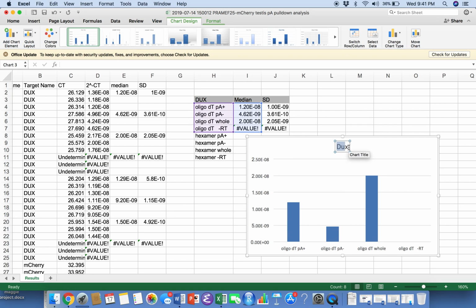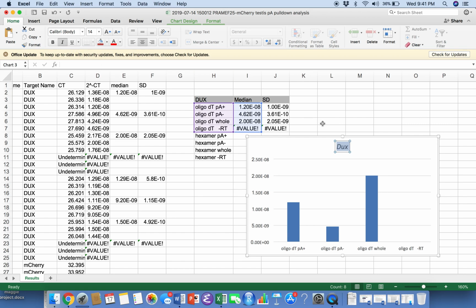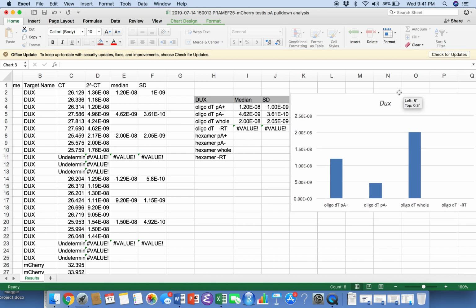and you were totally right about the nomenclature. Thank you for pointing that out. It should be italicized and only the first letter capitalized. I was using human nomenclature, so thank you.